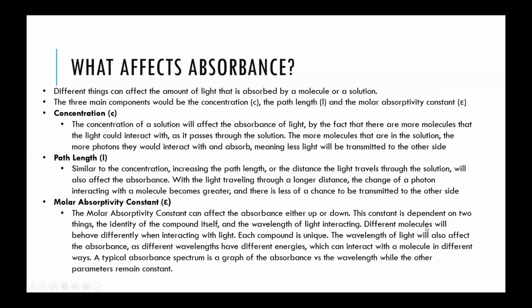So when we're looking at spectroscopy and how light interacts with different chemicals, we'll look at the absorbance. How much light did the chemical block and absorb into itself and increase its energy by that amount? There are 3 primary things that will affect the absorbance of a solution. First off is the concentration.